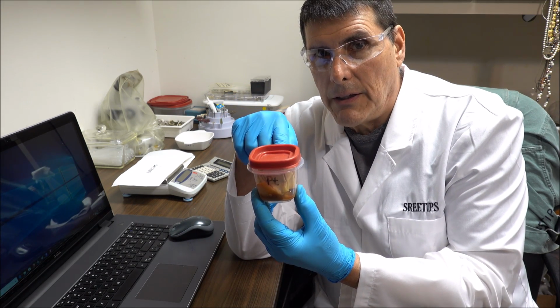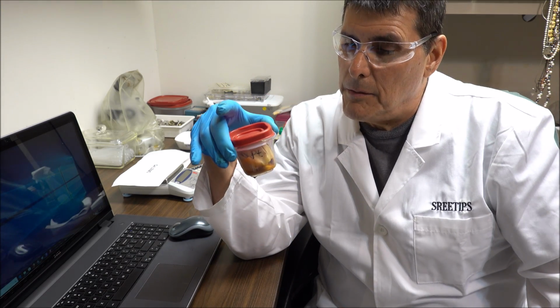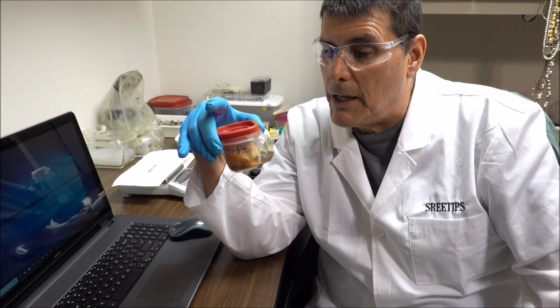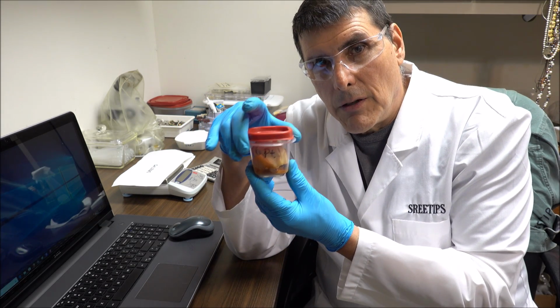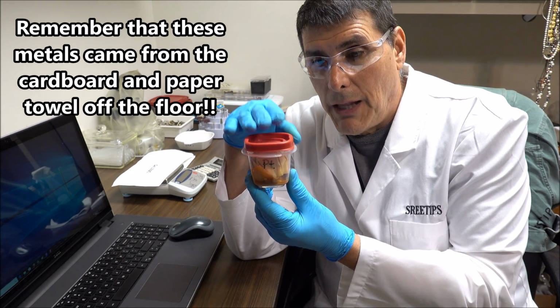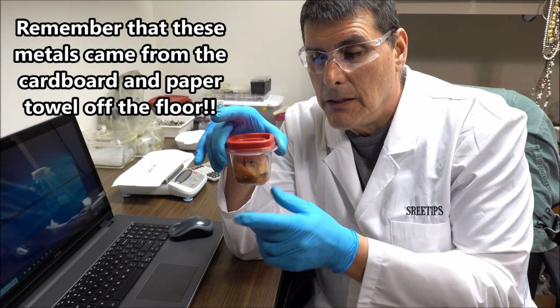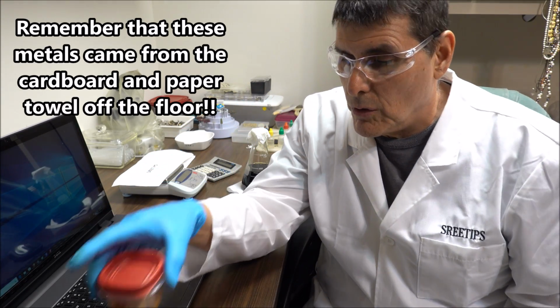This is going to be like it sits. I could burn this and get the platinum sponge, but it would be full of palladium and possibly other platinum group metals. So I'll have to do this in a completely separate video. But anyway, I got me some platinum out of my stock pot. I don't know exactly how much, but at least I got something to show for it.